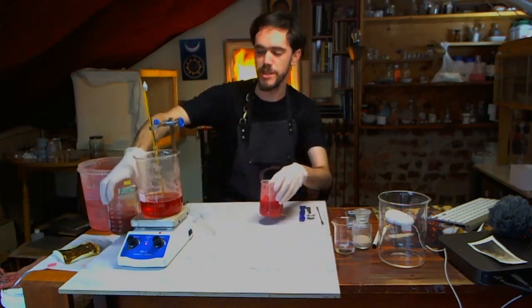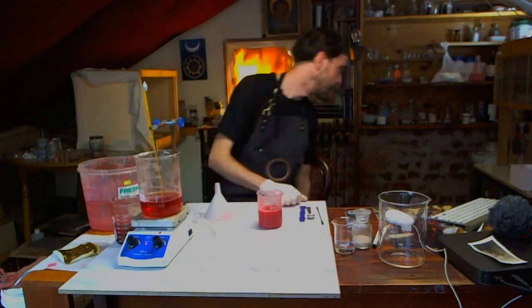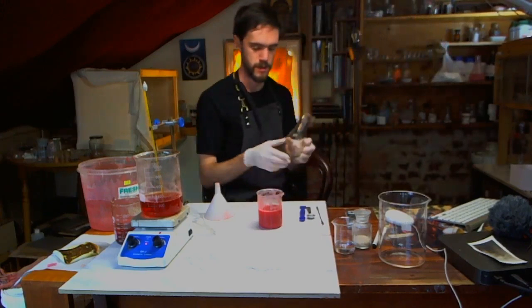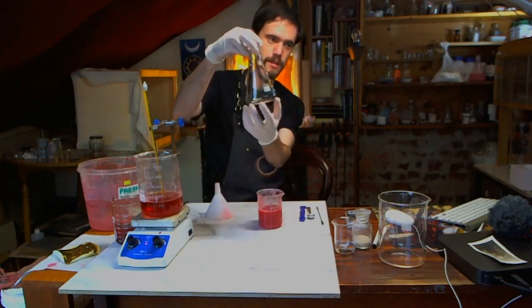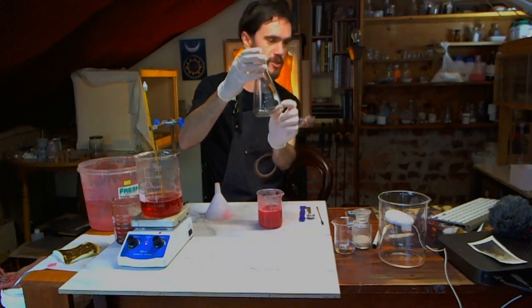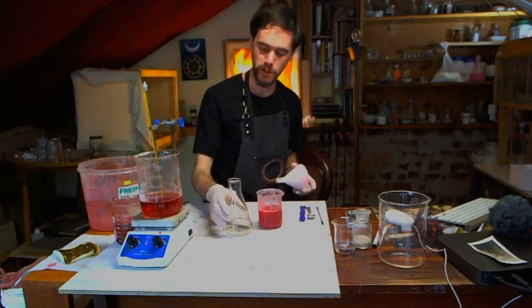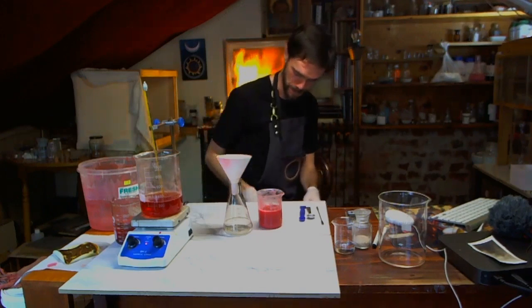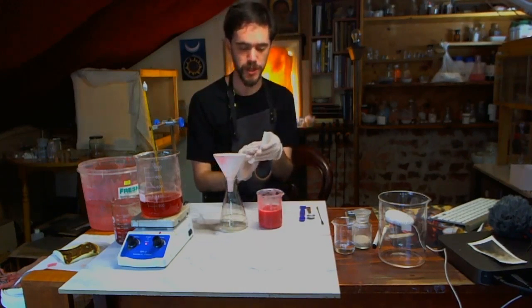Actually, we will filter this off because I need this beaker. The Erlenmeyer flask I was using yesterday, the pomegranate left a bit of a residue in there that I'm gonna have to try and get off at some point with, I don't know, a sodium hydroxide wash or something. Bit annoying. So we're just gonna use good old gravity filtration here.